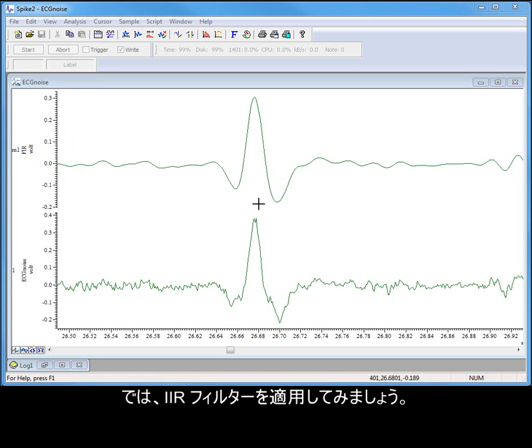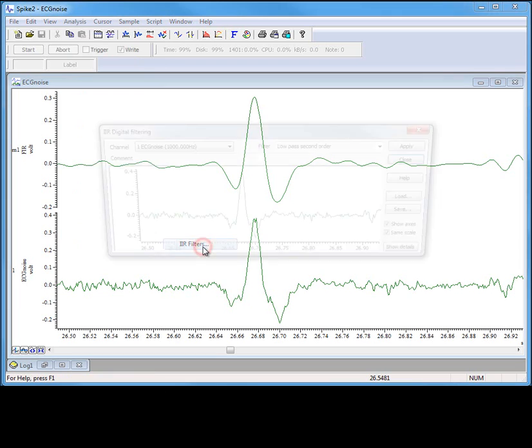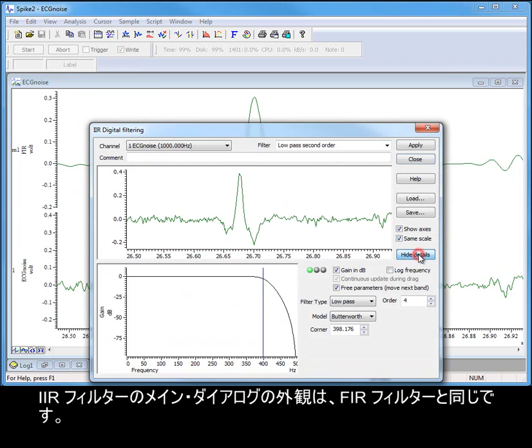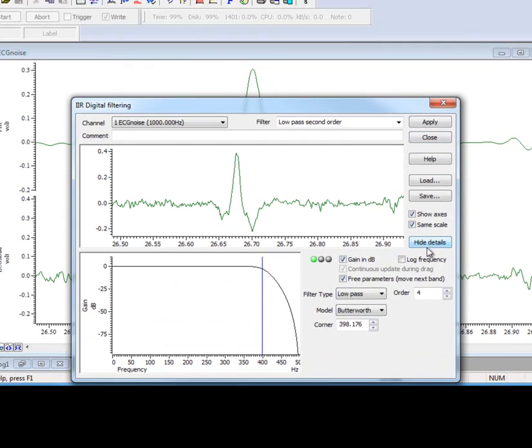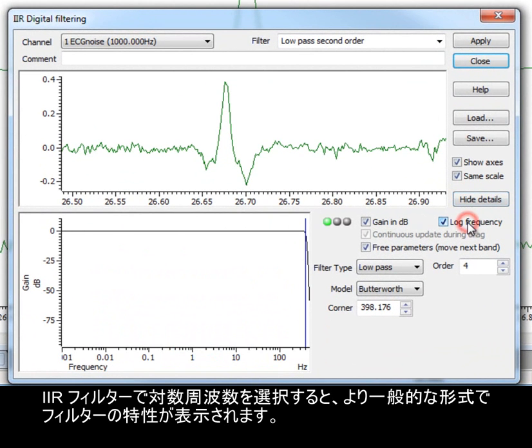Now let's apply an IIR filter. The main IIR filter dialog is the same in appearance as the FIR. Selecting Log Frequency for IIR filters displays the filter characteristics in a more common form.